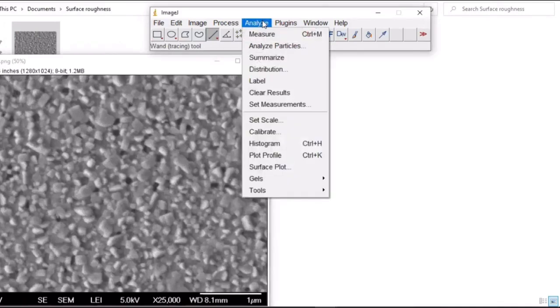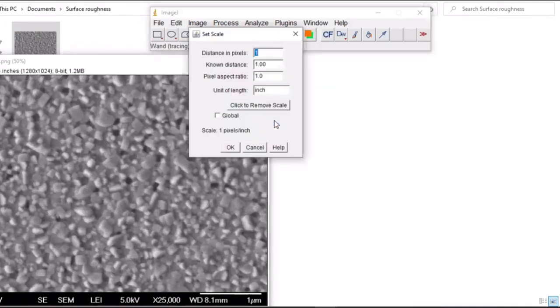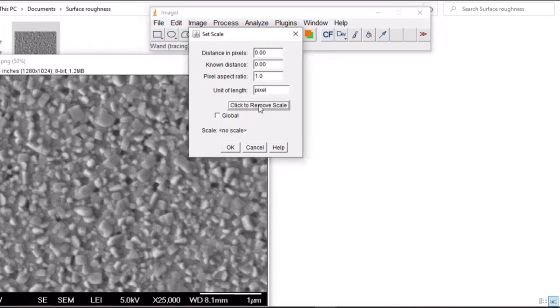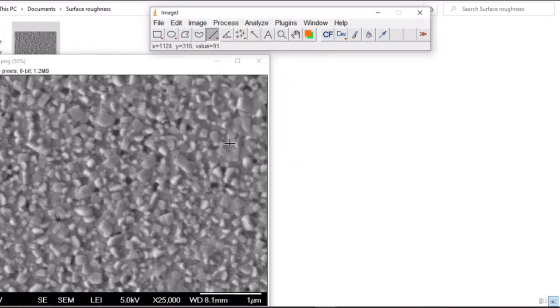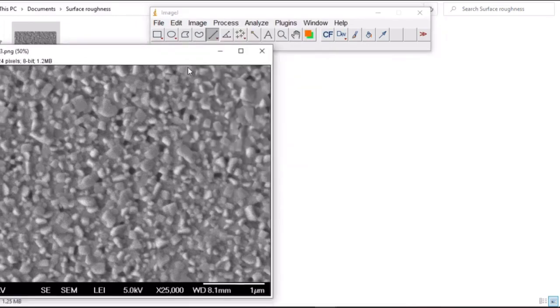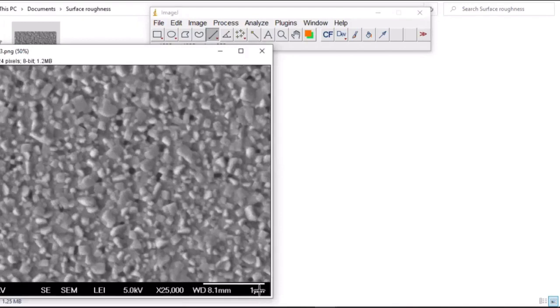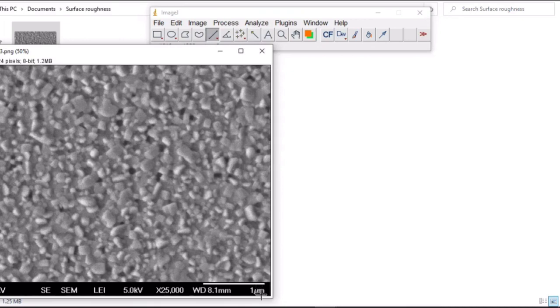Then go to analyze, set scale, and click to remove the scale. You need to note the unit here because sometimes the result is in nanometer, but here we have it in micrometer.